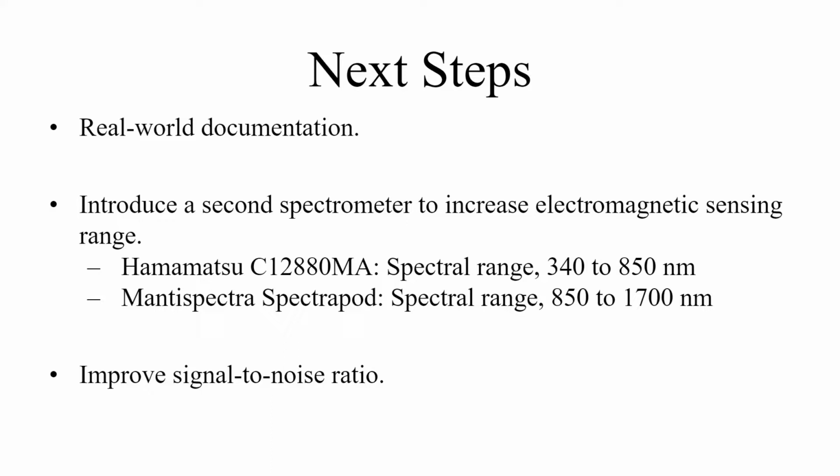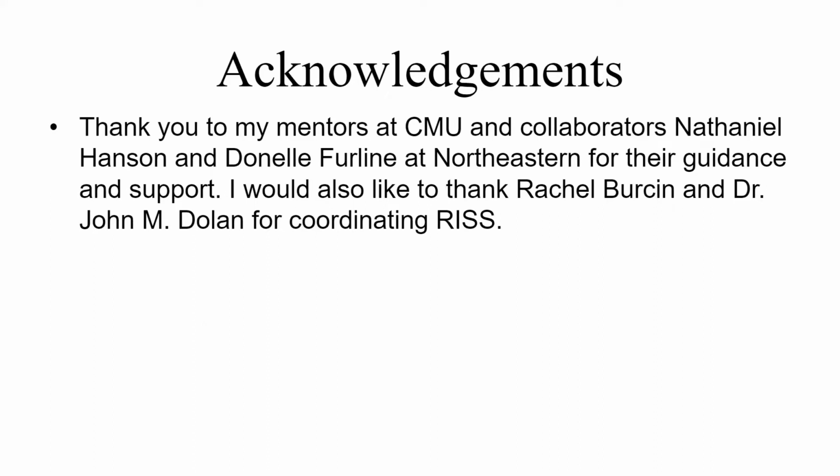For future steps, we plan real-world documentation, which will include a robot demo and introducing a second spectrometer to increase the electromagnetic sensor range. We also plan to improve the signal-to-noise ratio.